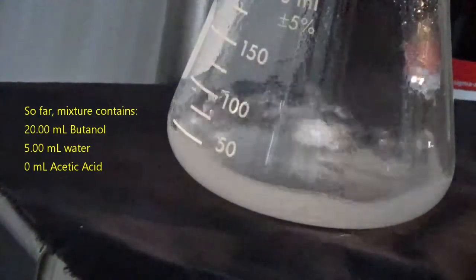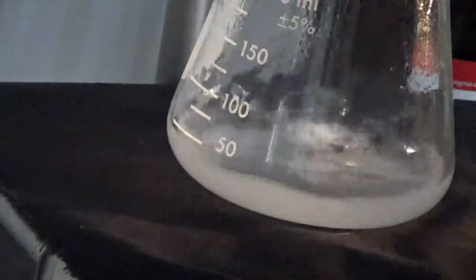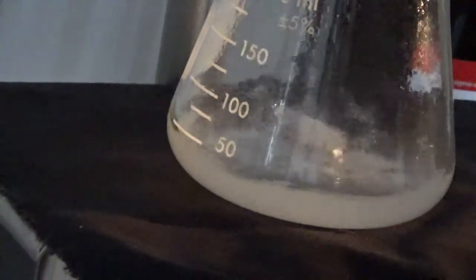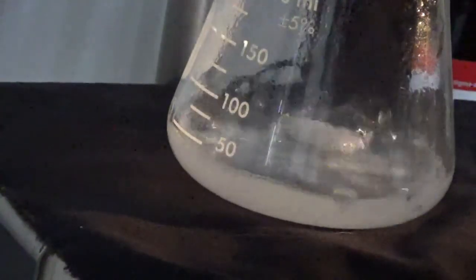I'm going to drip some acetic acid into that. It's going at a very slow pace, those drips, I think. Yeah, so slow it's practically not happening at all. Maybe that's a good thing.